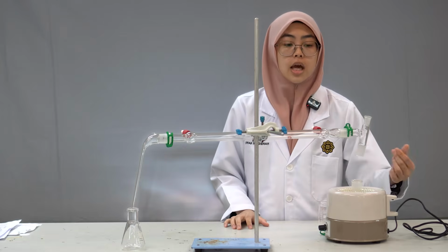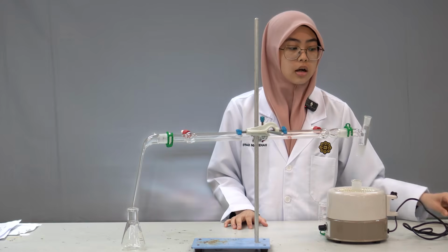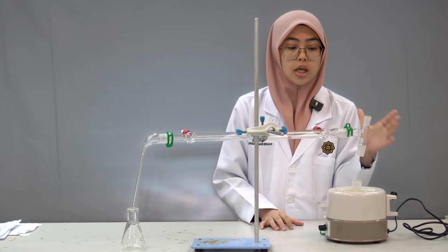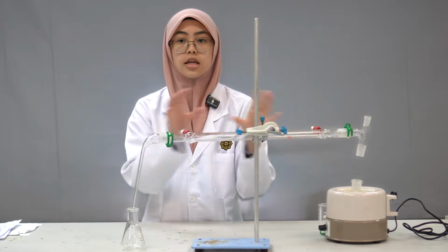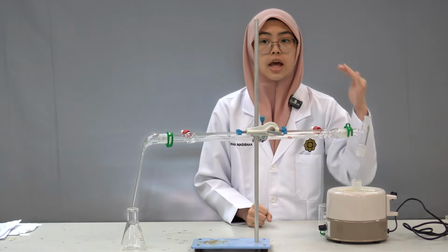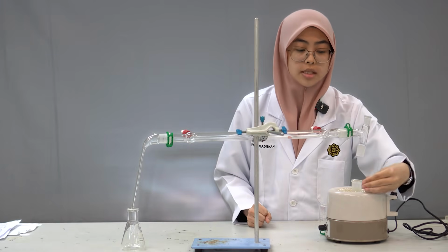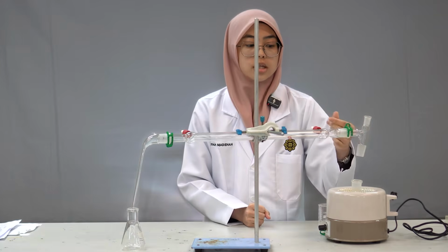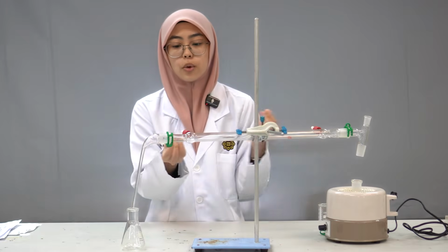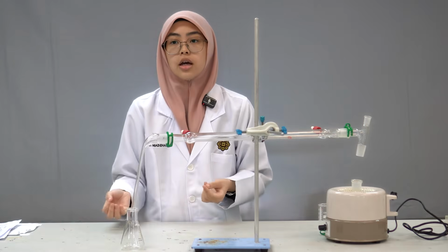When we turn on the heating mantle, we need to monitor the temperature and stop at the boiling point so that no other compound will vaporize in this distillation. So when we turn on the heating mantle and it reaches the boiling point, we will stop the heating mantle, and then the vapor will start to evaporate and meet the cooling water, and then the liquid will form at the end, and we will get the pure dichloromethane.